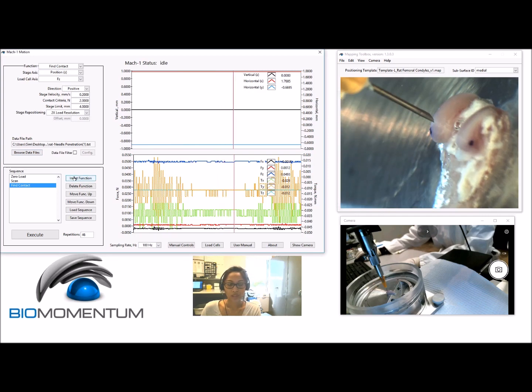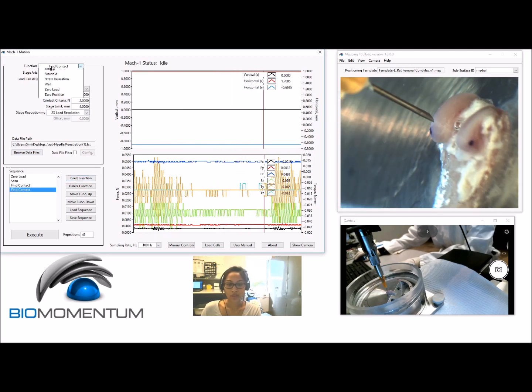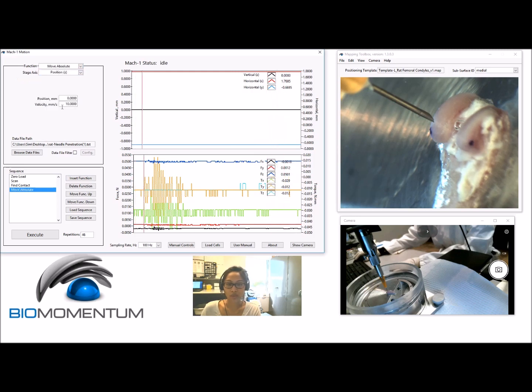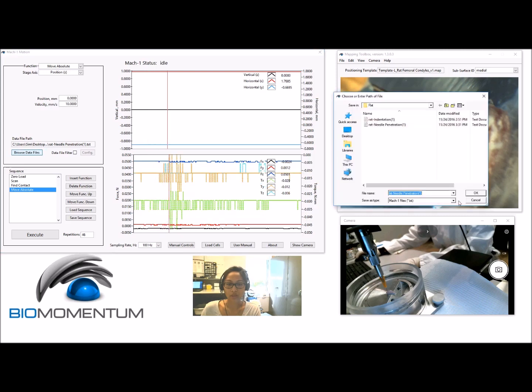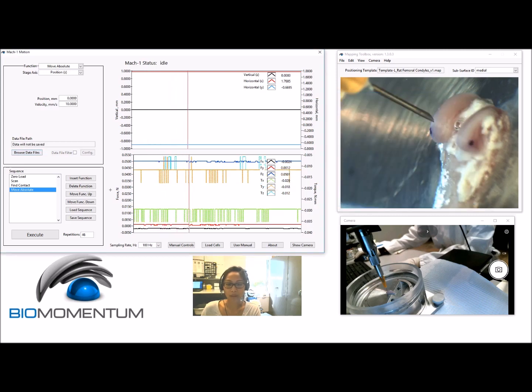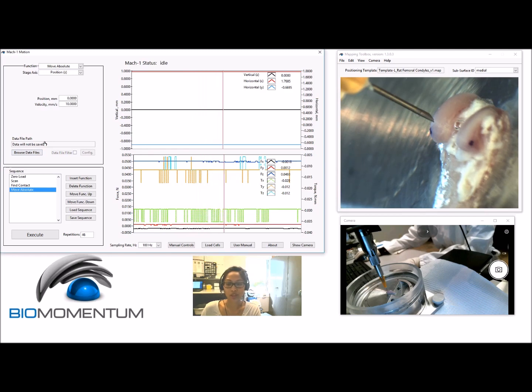Finally, add a move absolute function on the vertical axis in order to reposition the needle at 2 mm over the highest point of the surface. You do not need to save the data from the move absolute function.